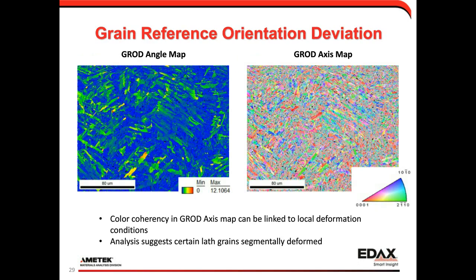We can also look at deformation with a GROD, or Grain Reference Orientation Deviation map, in both an angle map and an axis map. With GROD, we first calculate an average orientation per grain, then look at the misorientation of each point relative to that average — as an angle on the left or a misorientation axis on the right. We can see deformation within some of the laths, and in the axis map, structured misorientations appear as solid colors, showing a grain with some coherency along the length of the lath.